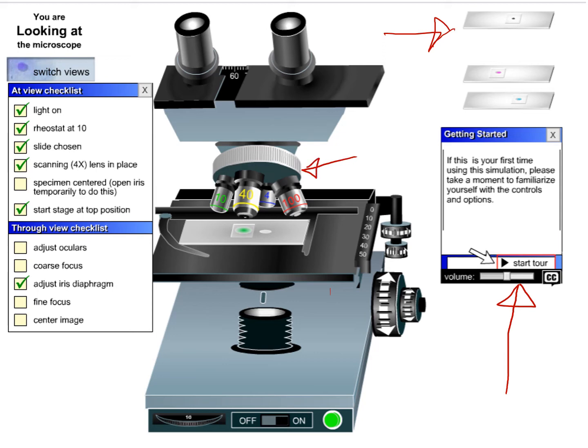This dial here is how you adjust the magnification. There's a four in blue in the back, then 10, 40, and 100. The ocular lens here, that has another 10x of magnifying power that is always built into it in pretty much every microscope. This microscope has two eyepieces to look through for two eyeballs. Some microscopes just have one. Because this is two, you'll need to adjust the distance between them together. The ocular eyepieces can be adjusted to fit you. Just grab on them with the mouse, hold down the clicker, and then move them left and right.